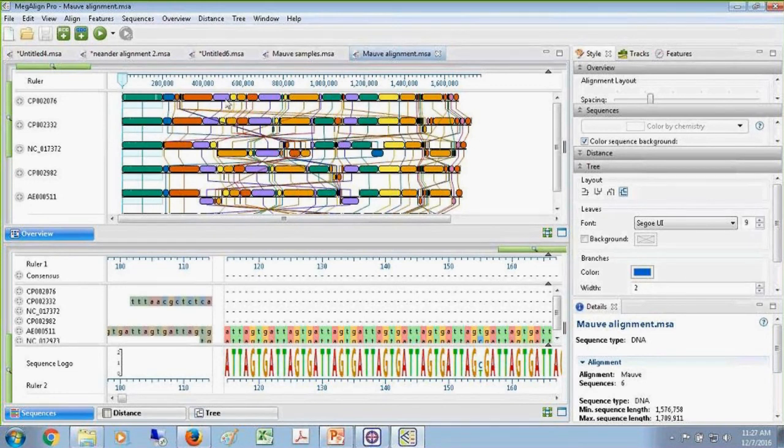And the importance of this is when you're looking at entire genomes, frequently you get rearrangements, which renders other methods of alignment incapable of completing them. Once you start moving regions around, other methods just will not work at all. They end up spacing them and having large gaps. Nothing ends up being aligned except for small portions.